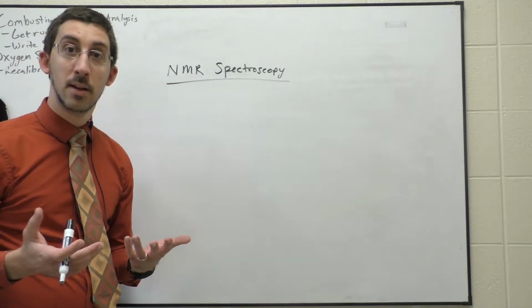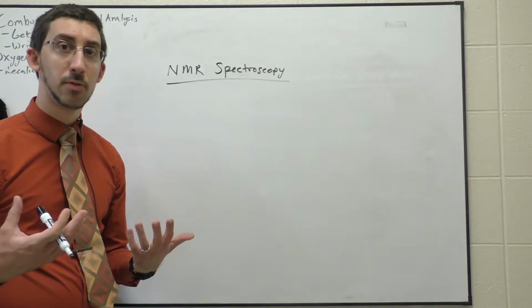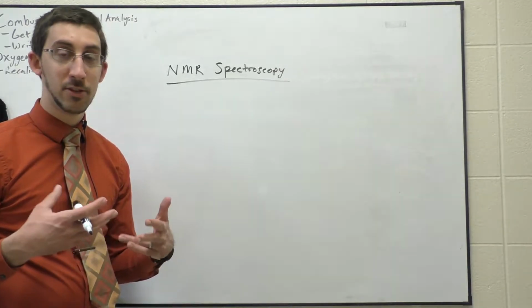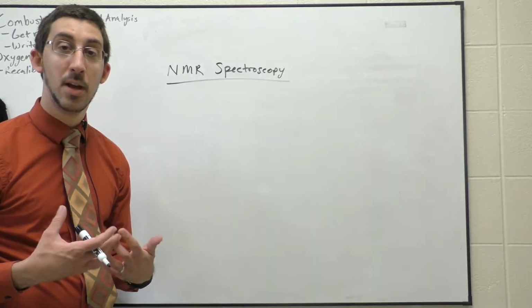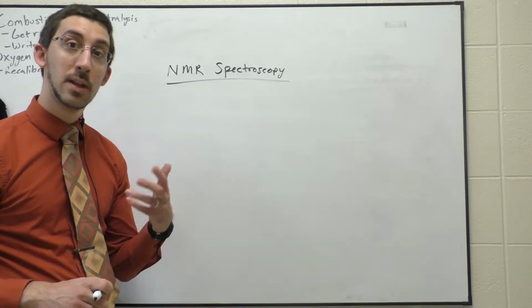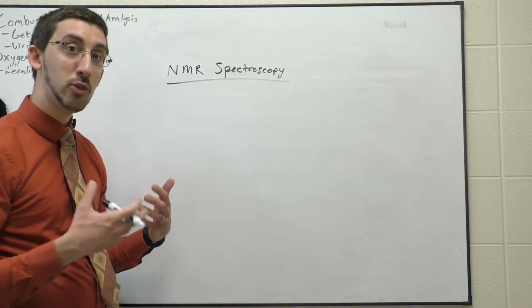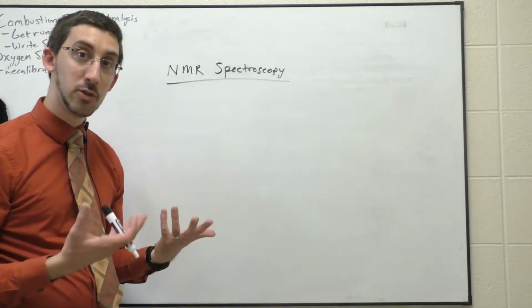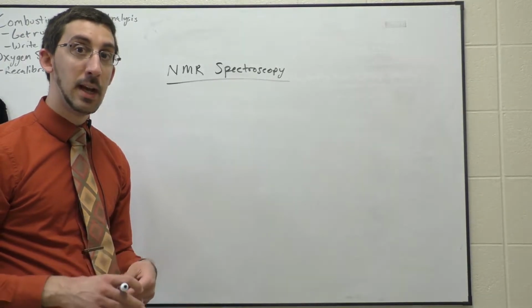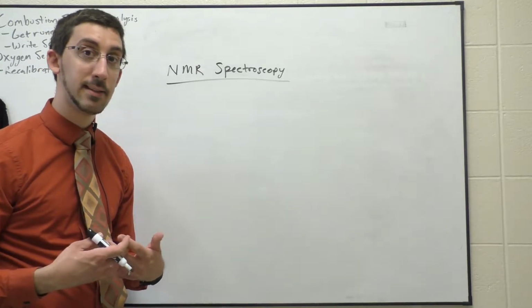NMR spectroscopy. Again, there's probably many videos and even online simulators for NMR spectroscopy. The purpose of this lab is to give you as much hands-on as it can be in an online environment, but some real practical experience prepping an NMR sample, both liquid samples and solid samples, prepping them for NMR analysis, and then the actual operating techniques for measuring and acquiring a spectrum in the NMR room with an NMR spectrometer.